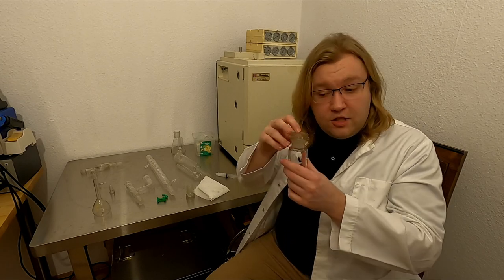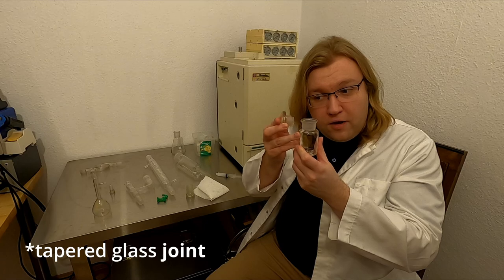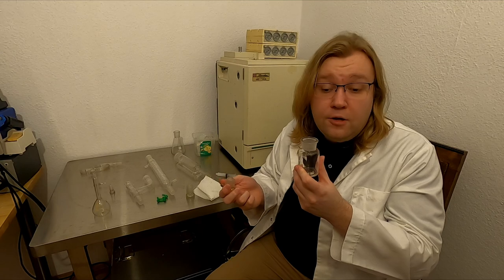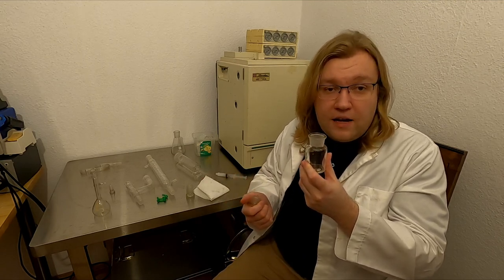Some glassware, such as the storage flask, may have a tapered joint that is not the same angle as all the other glassware. This is to prevent locking. Do not confuse this glassware with laboratory standard taper glassware.